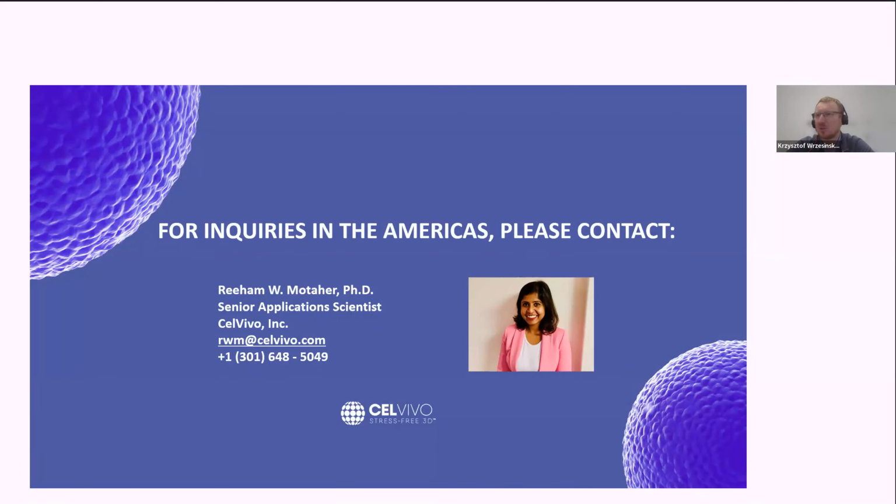I would say please look on the web page of CelVivo. There is the link to the publication. I don't know, Riham, because you probably see who has asked that, maybe you can send the link to this person. And the second part: if you use hydrogels, quite often different types of hydrogels have their own so-called releasing agent, which you can use to get rid of your artificial ECM. But that will depend on which one you are using.